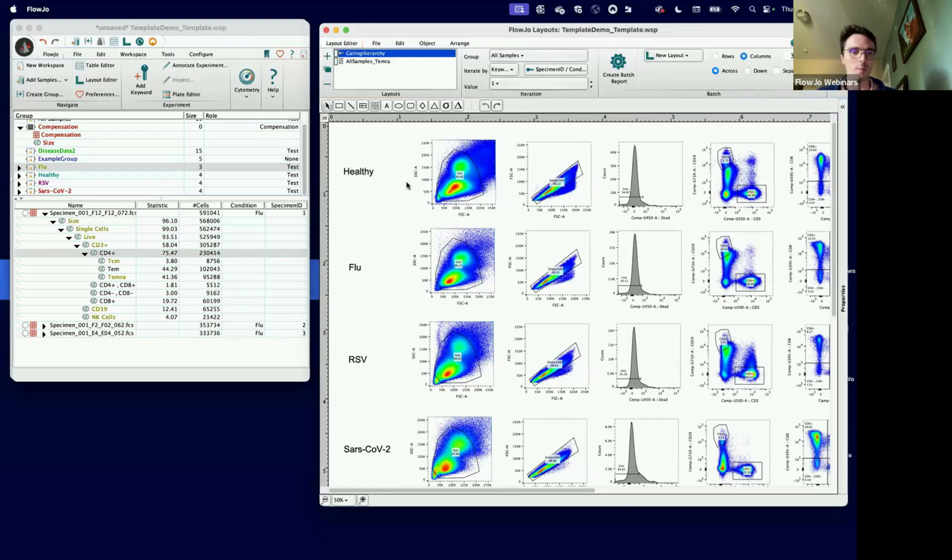So it's quite a large file, but the advantage is if you move the ACS or if you share it from one computer to another, say you give it to another user, you don't need to give them all your FCS files as well. It has everything packaged together. The ACS file also will save versions each time you save it, and so there's a few advantages to the archive or ACS format. Doesn't really have anything to do with templates though, but it's a different file type that you could use.